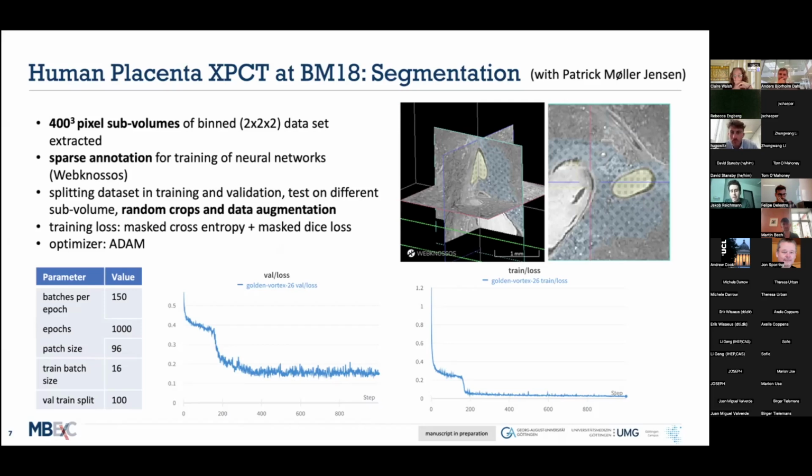There are also other things you can do by applying them to your placental tissue, for example calculating shape measures or differences, which I didn't present here, but which would not really require any segmentation, just working on the gray values. This would also be very interesting to see abnormalities in the tissue and differences between, for example, healthy and control. Yeah.